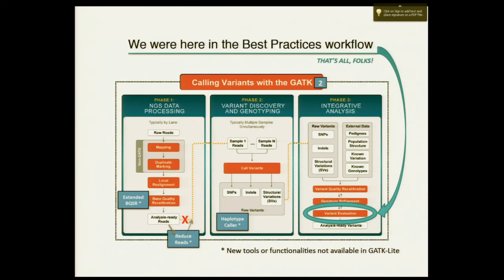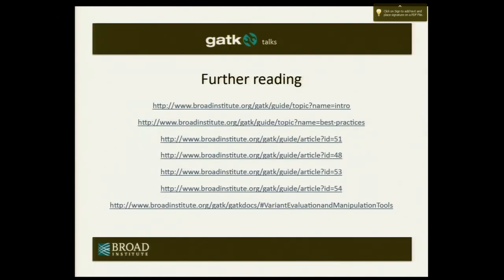So that's a whirlwind tour through the workhorse methods of variant analysis and evaluation in QC. All of this is complicated stuff because there's a lot of potential analyses you want to do, and we try to make them all available to you. What I've shown you is just a very stripped down subset of what you can do with these tools. So please look at the GATK docs and play around with these for a while. They'll really help you.